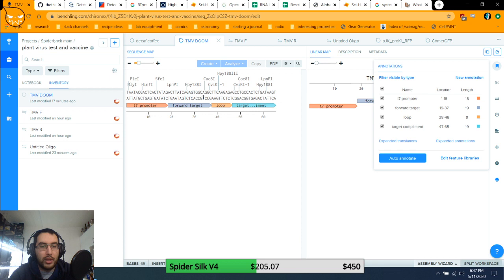So then I could take that now solution of RNases and individual RNA letters, and I could mix it with a protease, which is a type of enzyme that basically destroys enzymes and other proteins. So if I mix the RNases with protease, it'll destroy the RNases, and now the only thing left active is the protease. But unlike RNases, protease can be turned off with heat. So I can now take solution C and heat it up and kill it. So there's nothing left active.